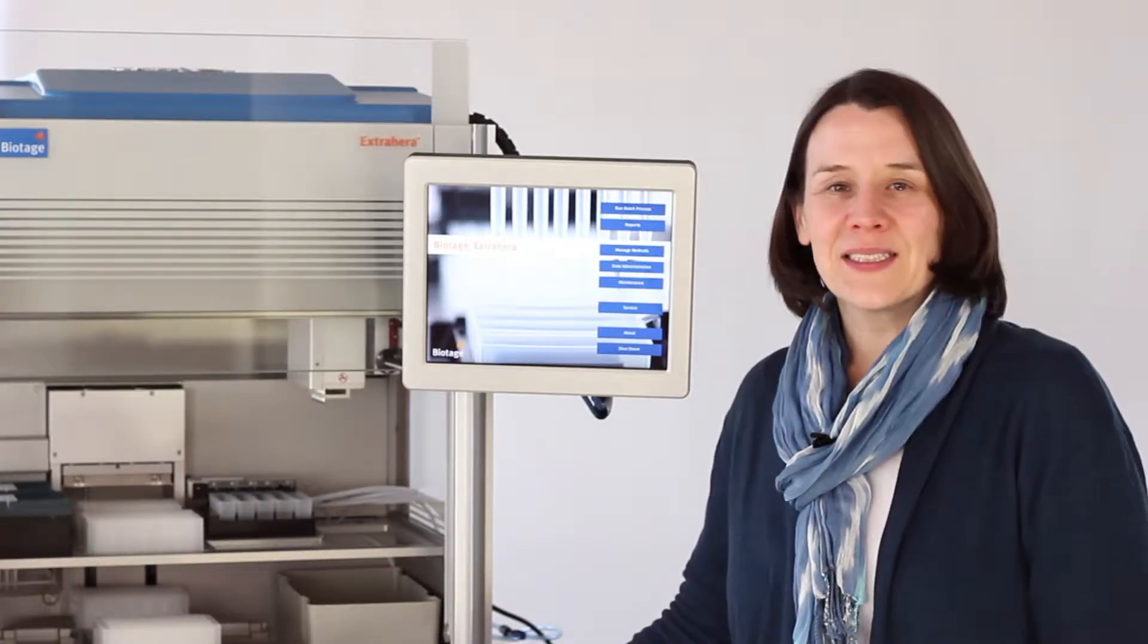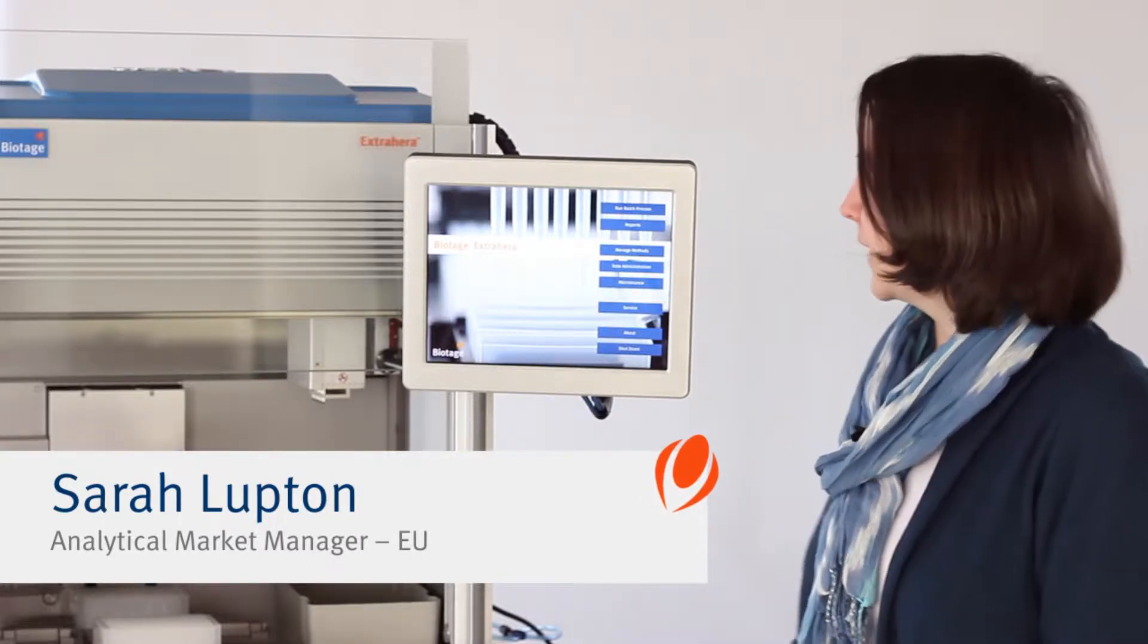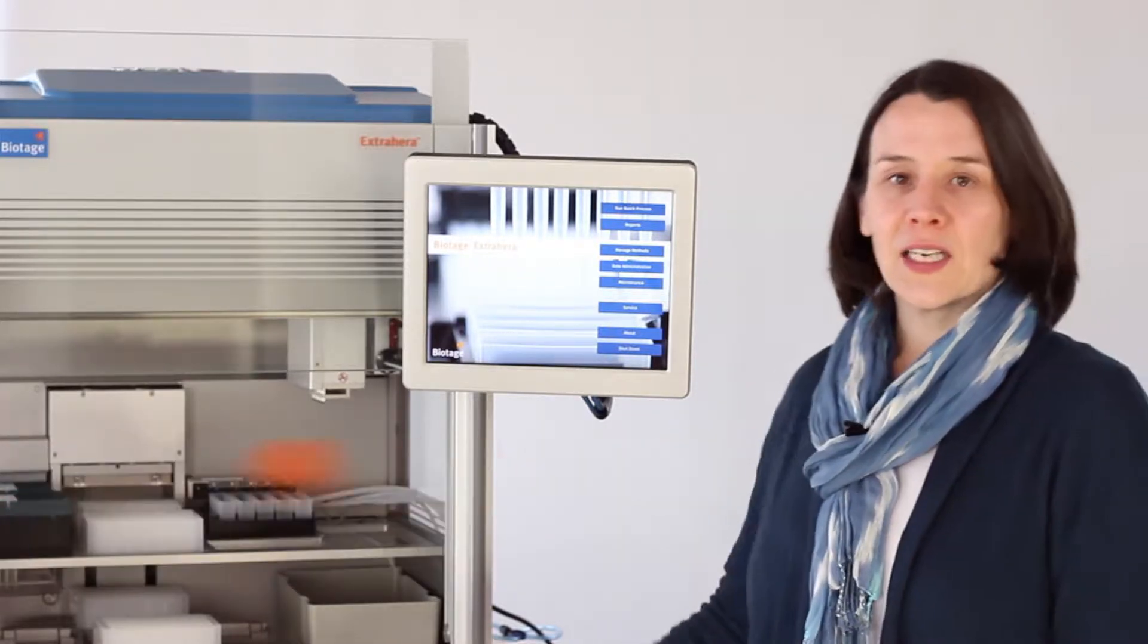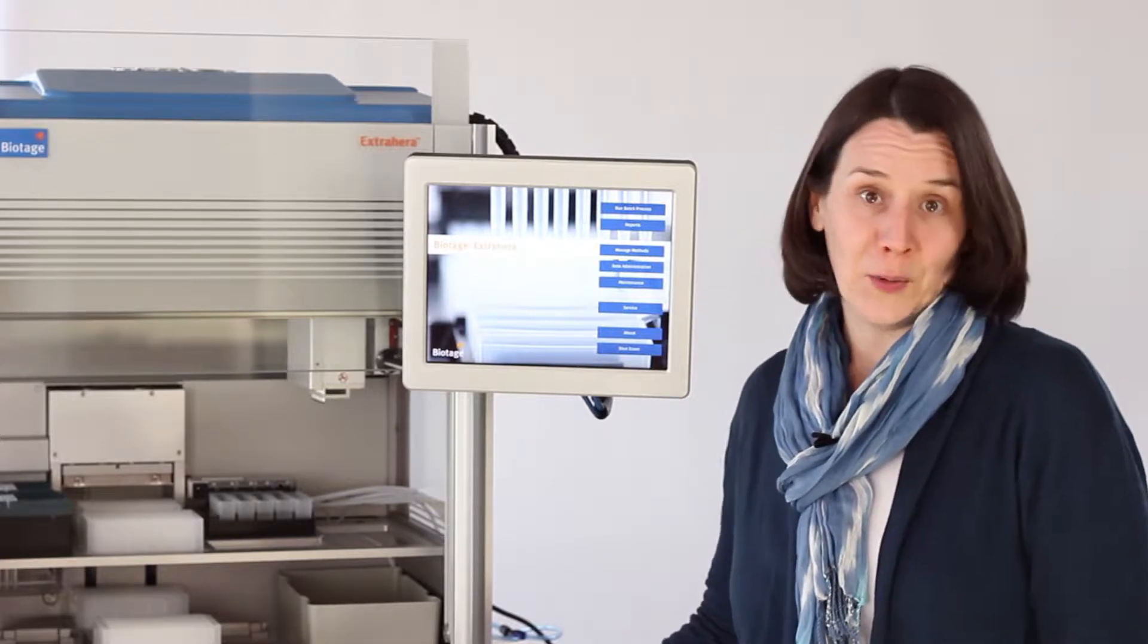Hi, my name is Sarah Lupton and I'm the principal trainer in Europe for ExtraHera. In this video we're going to see how you set up and run your method.